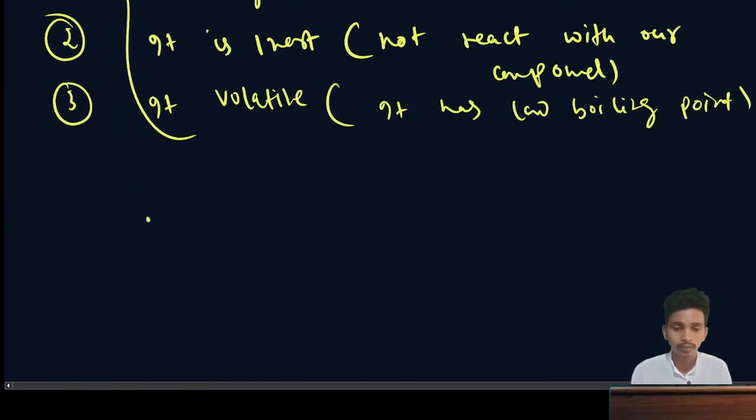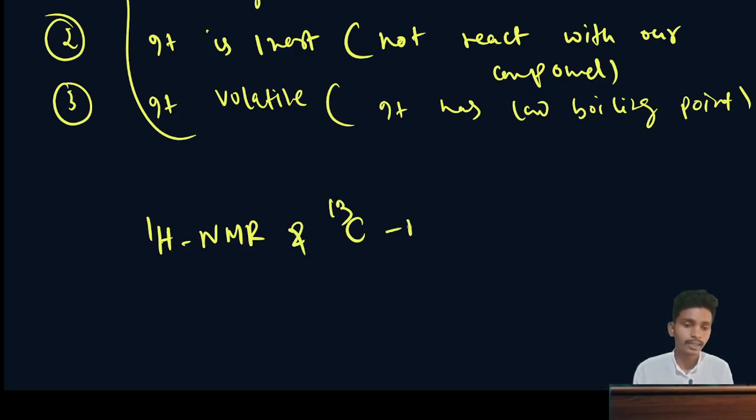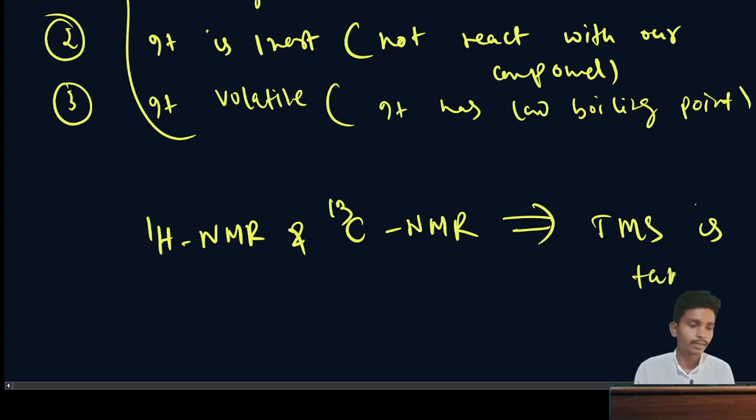So in 1H NMR and 13C NMR, TMS is taken as the standard reference.